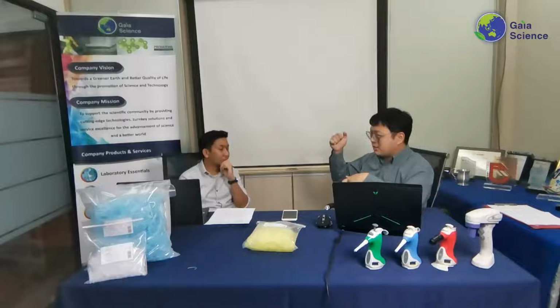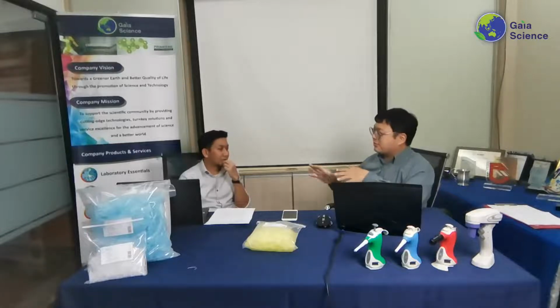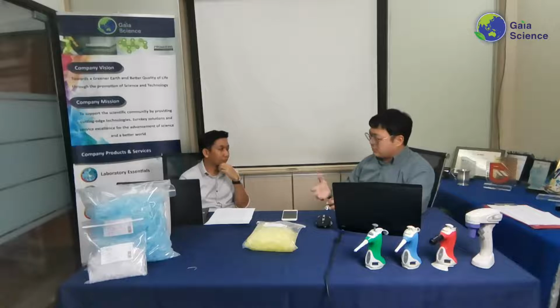If you have a 1,000 pipette, for example, see whether you can aspirate exactly 1,000 and then eject it. Also make sure the tips can fit into the rack. It doesn't matter which brand of rack you have. Whichever brand you get, if they say it's universal, check for that as well.